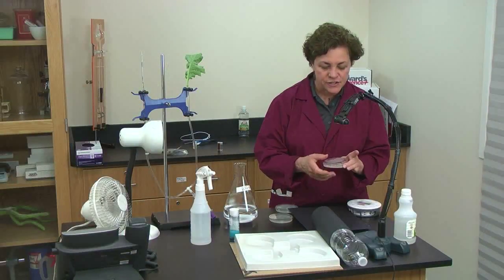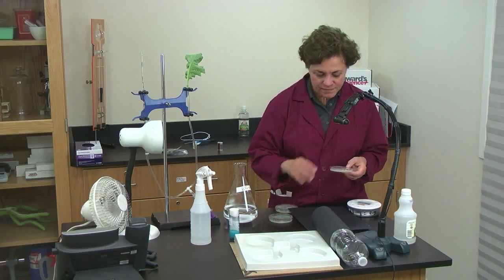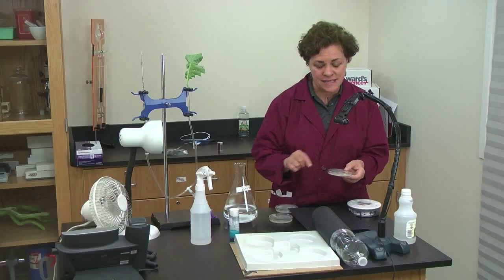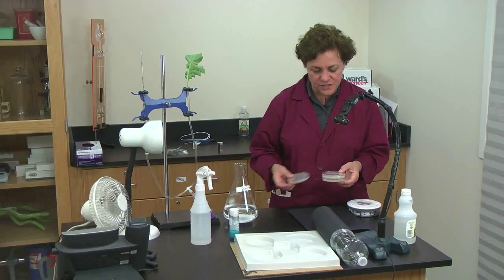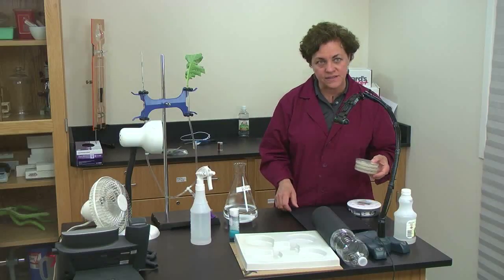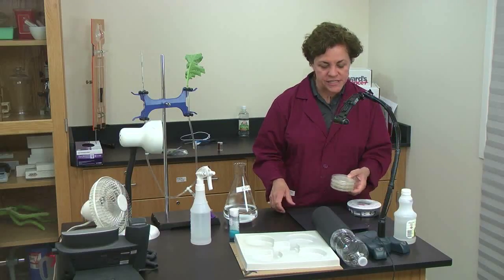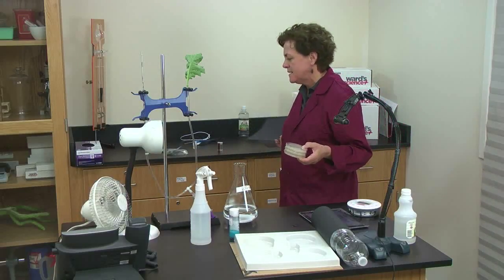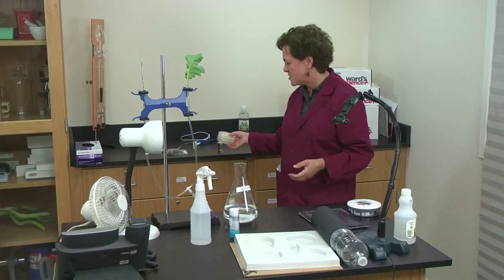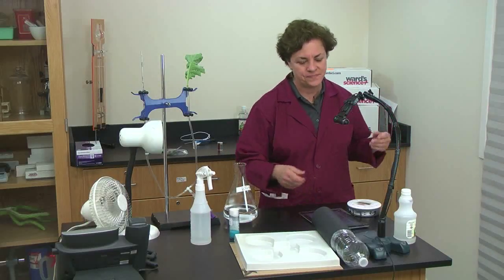When you're done, you're just going to bleach these like you do any bacteria, because these little guys have a lot of bacteria on them, and then you can just toss them like anything else. All right, so this was actually recommended by College Board, and we just added this. So if you order this kit and you get nutrient agar plates, and you wonder, why do I have nutrient agar plates with this kit? That's what it's all about.